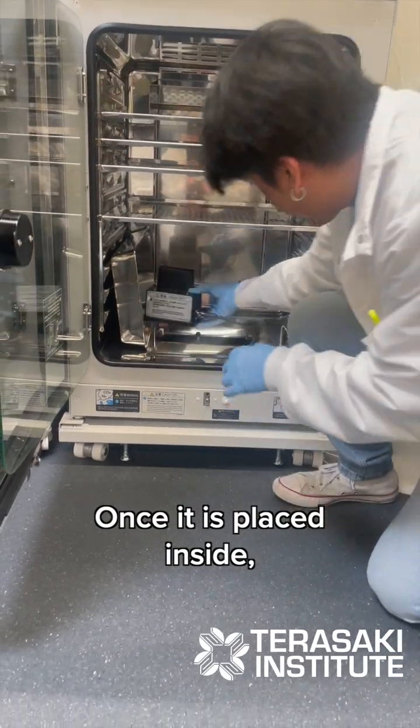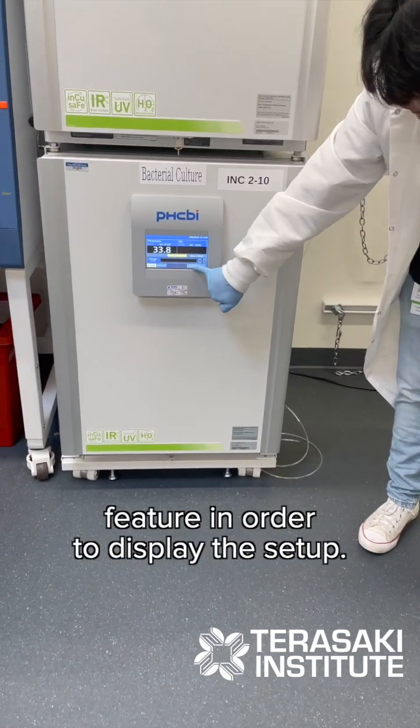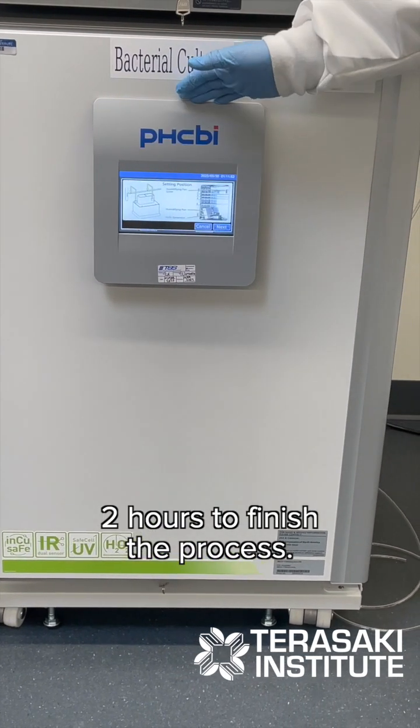Once it's placed inside, we're going to press the hydrogen peroxide button feature in order to display the setup. Once the setup is there, we're going to come back within two hours to finish the process.